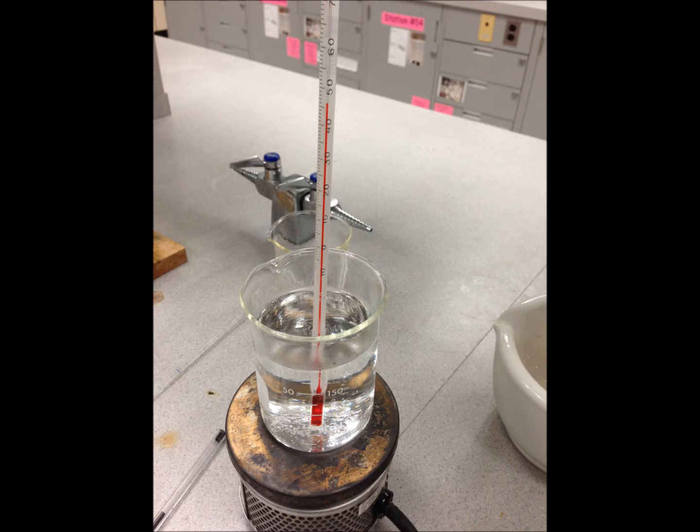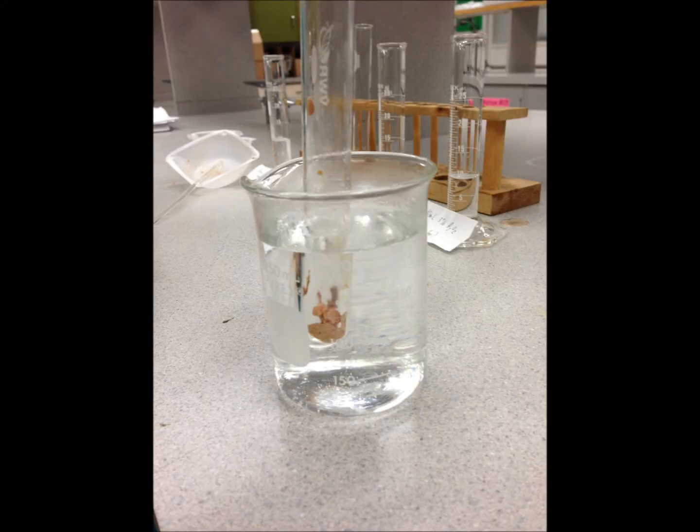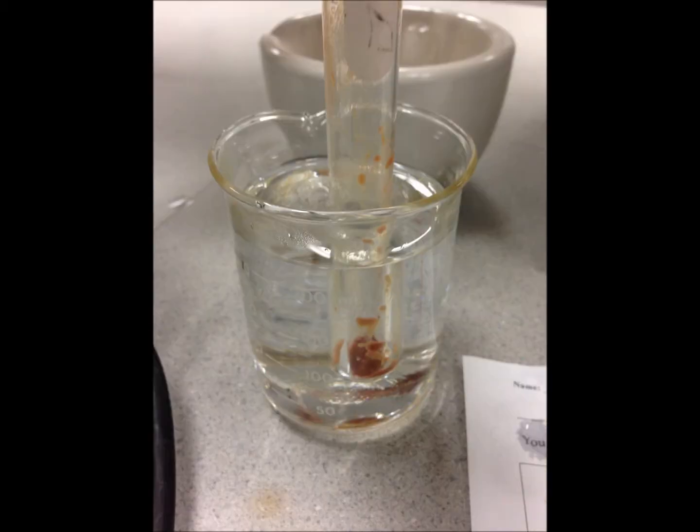First, we took 3 beakers and 3 test tubes. We filled 1 beaker up with water and placed it on a hot plate to create a hot water bath. Then we put 1 gram of crushed liver in each test tube. We placed 1 test tube in the hot water bath on the hot plate. We waited until the temperature turned to 45 degrees Celsius.